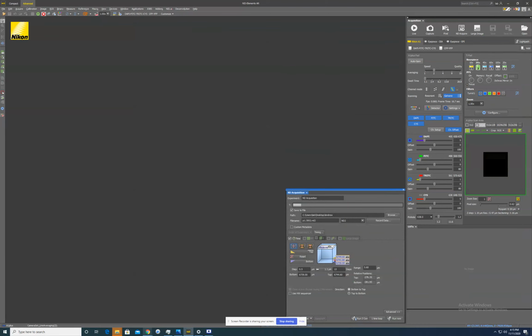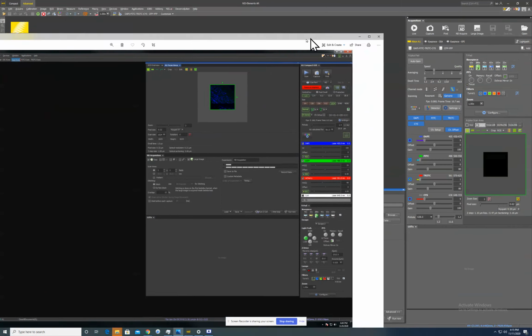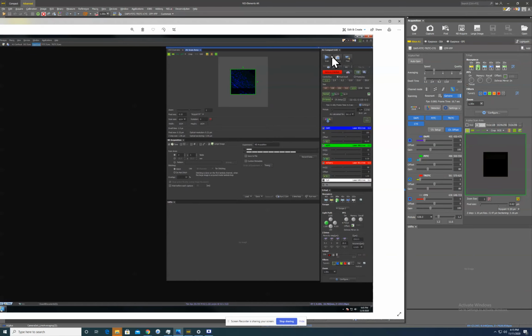new layout. So getting started, the first thing you probably do when you set up with a microscope is you engage the eye port and you get your sample in focus by eye. On the old layout, you would do that by hitting the eye port button, doing your eye port stuff, and hitting the eye port button again to disengage it.